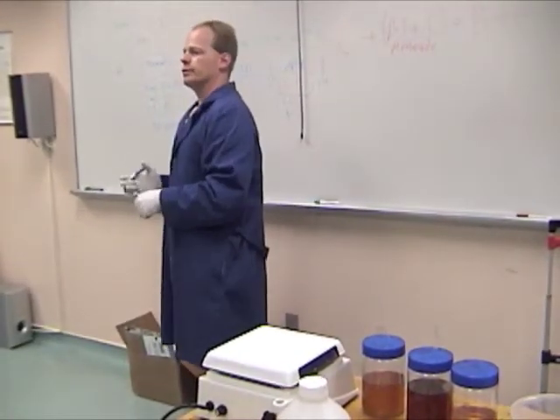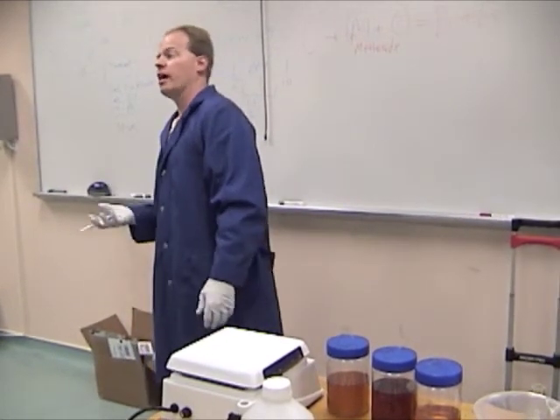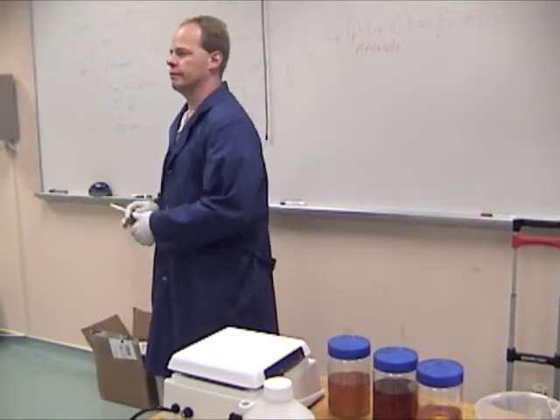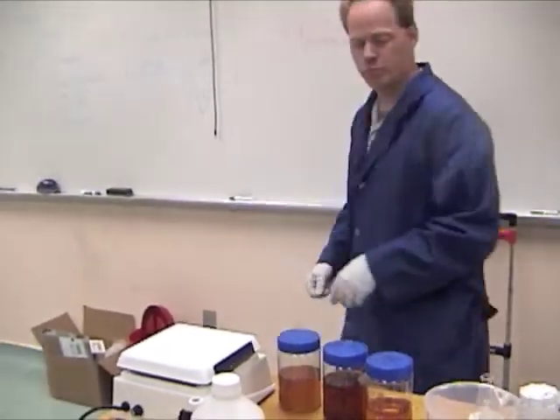The other secret too is I always like to do 3 titrations, because sometimes I can be off, and then I average the middle. That'll get you good. That'll also let you know if you've been somewhat accurate with your stuff. Okay.